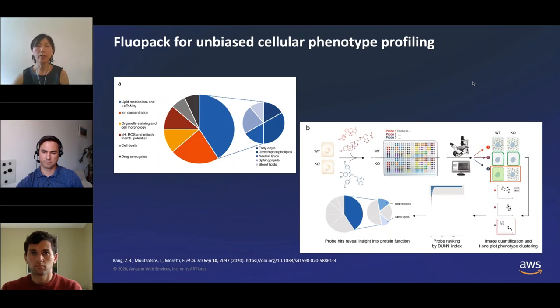After incubation for a certain period of time, those cells are imaged by confocal microscopes, and the resulting images go through quantification, and then some clustering and ranking methods are used to rank these probes.